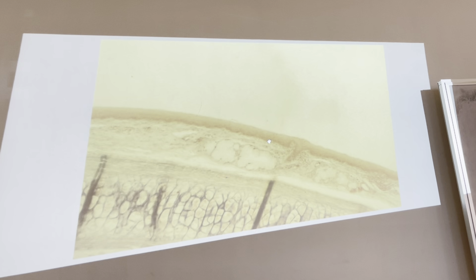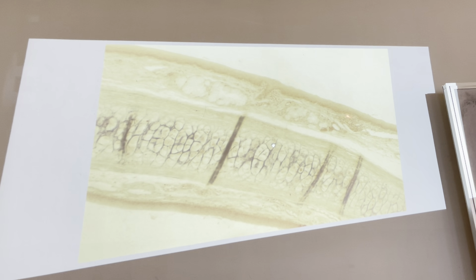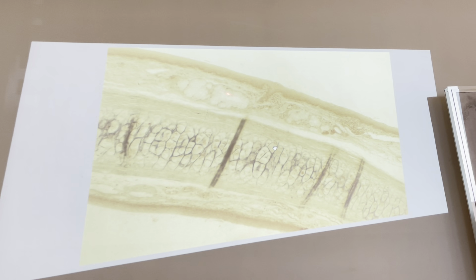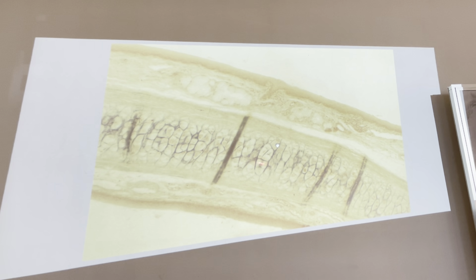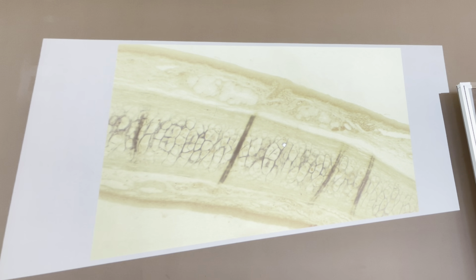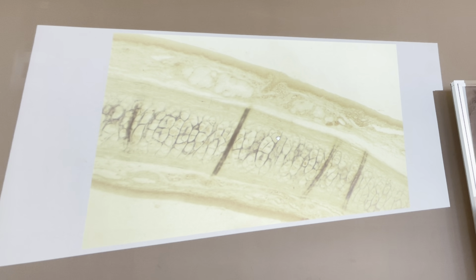Take a look. This is the mucosa, which is stratified squamous epithelium. This is the lamina propria, which consists of the seromucous glands. This is the duct of these glands, which open into the lumen of the larynx. And the core, it means the center part of this structure, is what? Exactly. How can we say this is elastic? By the presence of these dark lines, which are all elastic fibers.